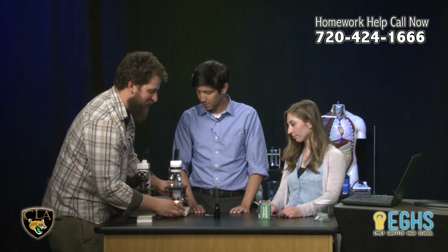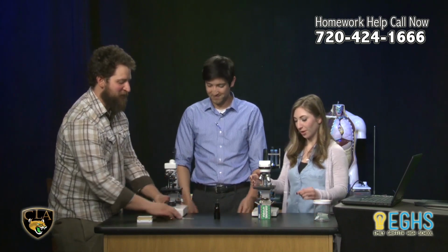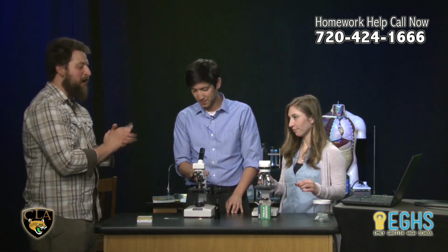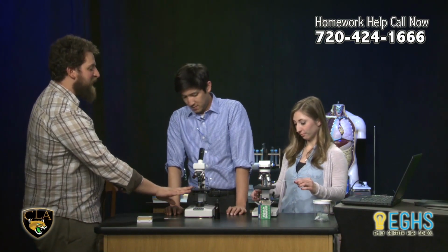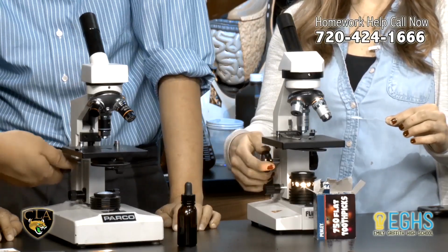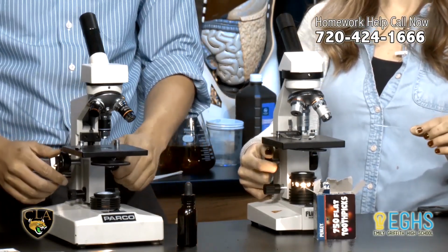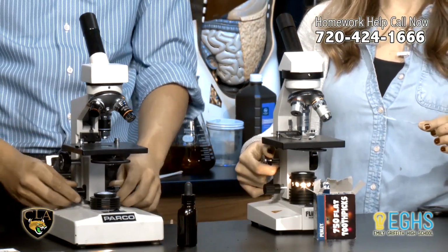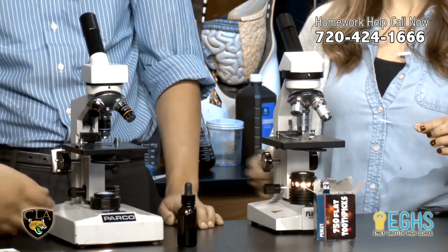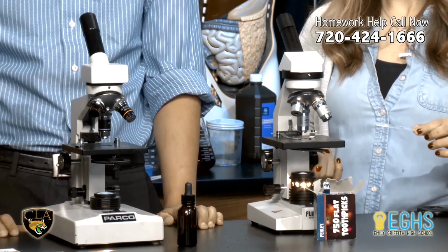Okay, so let me spread these out for you guys, and I'm here to help you as your biology teacher, but I'm going to try to walk you through this. The other part of the microscope that we should think about is the stage. So the stage can be raised and lowered by these focusing knobs on the left here. The largest focusing knob is called the coarse focus. It makes big changes to focus. Down here, this smaller knob is the fine focus. It makes smaller changes to the position of the stage. So we'll use that second.